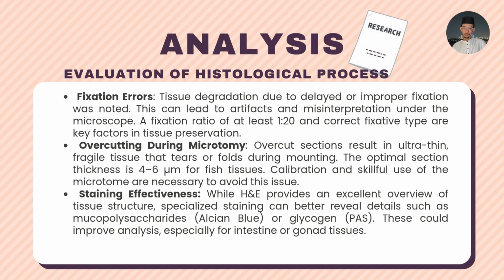For analysis, evaluation of the histological process. The first one is fixation errors. Tissue degradation due to delayed or improper fixation was noted. This can lead to artifacts or misinterpretation under the microscope. A fixation ratio of at least 1 to 20 and correct fixation type are key factors in tissue preservation.